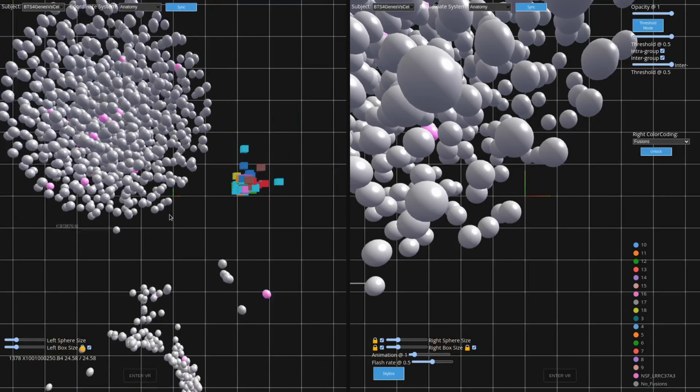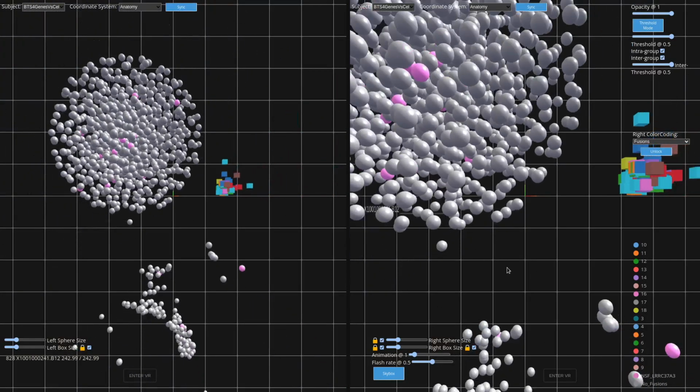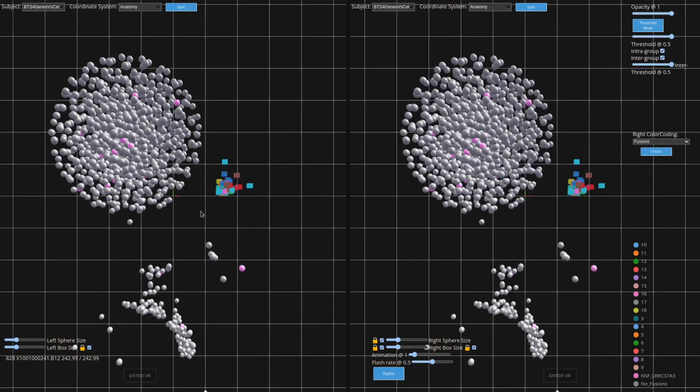Now this is a pure genomics data set. It's a single cell RNA sequencing study of about maybe 1,500 cells from a brain tumor, and they were just dissolved in solution and flowed through a single cell sequencing kit.